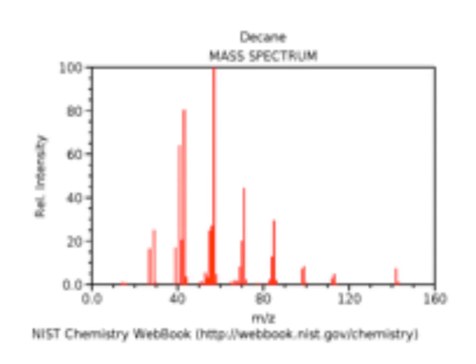Does this only apply still to electron impact? Yeah, we're only talking about electron impact. So these rearrangements may not necessarily occur in other techniques with other ionization methods, because if you don't generate the same type of ion, then the fragmentation patterns are going to be different. If you're ionizing just by protonating a molecule to form a cation, then you have no radical, and so radical mechanisms are not necessarily going to be favored. They would all be more cation-initiated mechanisms. Okay.